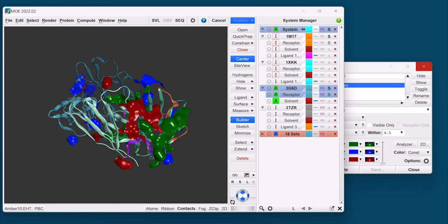Protein patches can be useful to assess potential developability issues. For example, a large hydrophobic region such as this, especially in the presence of the CDR region, could be a source of aggregation or self-association. Charged regions such as this can present issues with respect to viscosity.